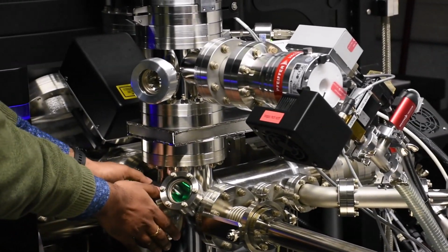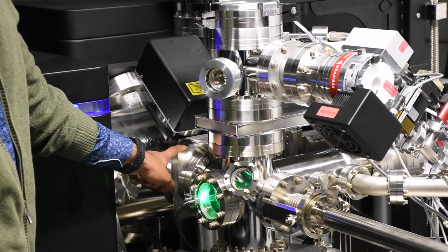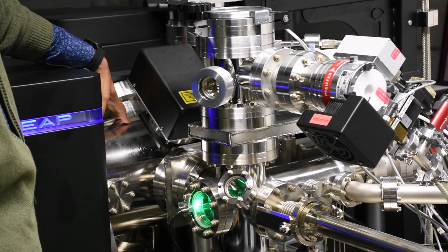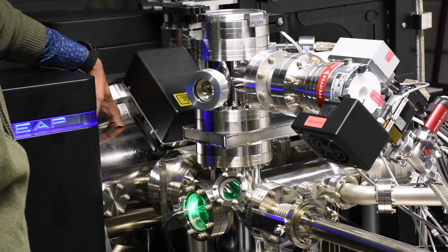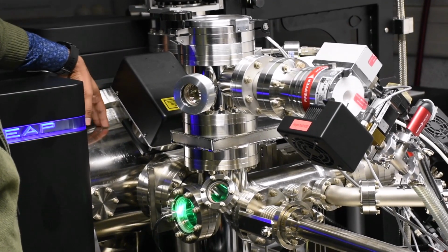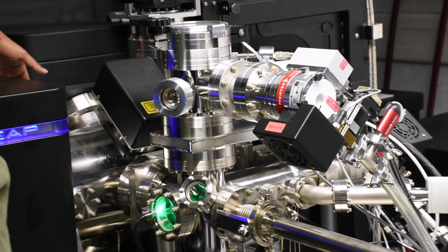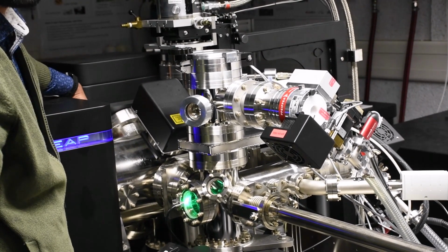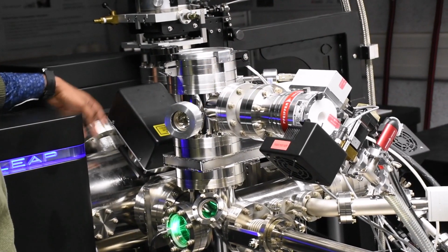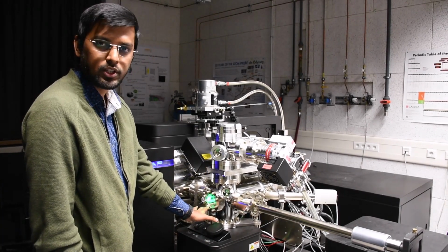Now the buffer chamber is separated from the analysis chamber, which is here, by this particular wall. And the analysis chamber itself is at a pressure of 10^-11 torr, and it's pumped by an ion pump. And the analysis chamber is equipped with a voltage pulsing unit and a laser pulsing unit. The laser pulsing unit is at the back of this analysis chamber, and the voltage pulsing units are at the back of the instrument.